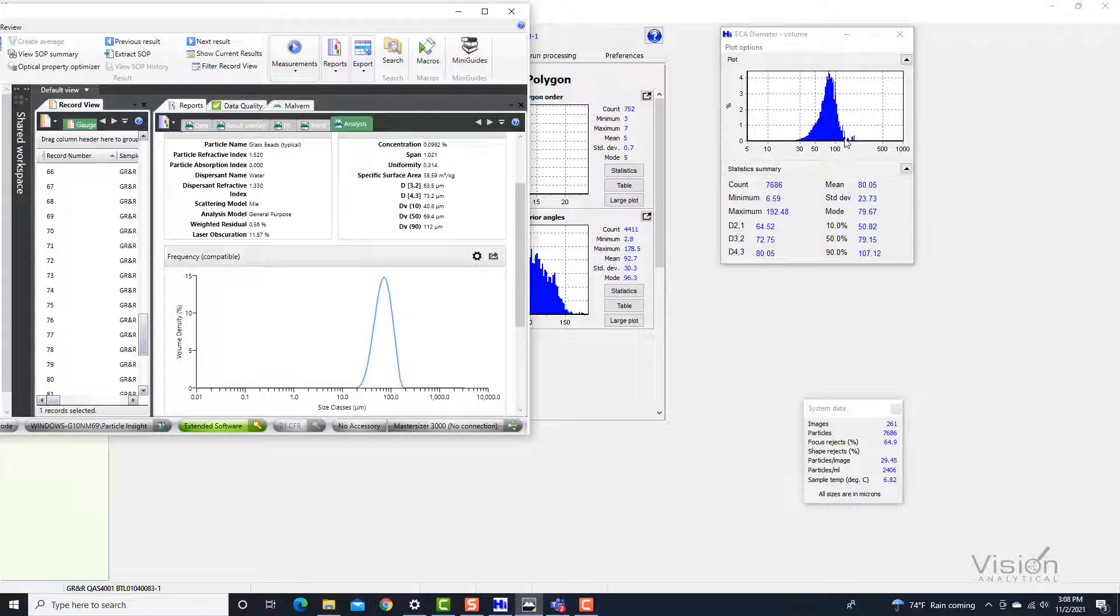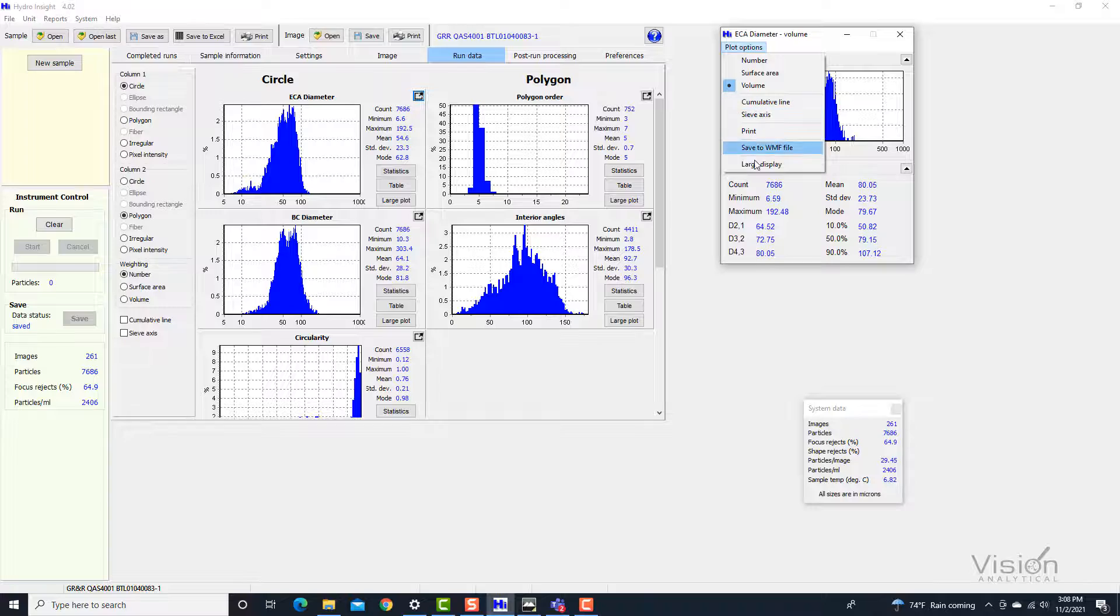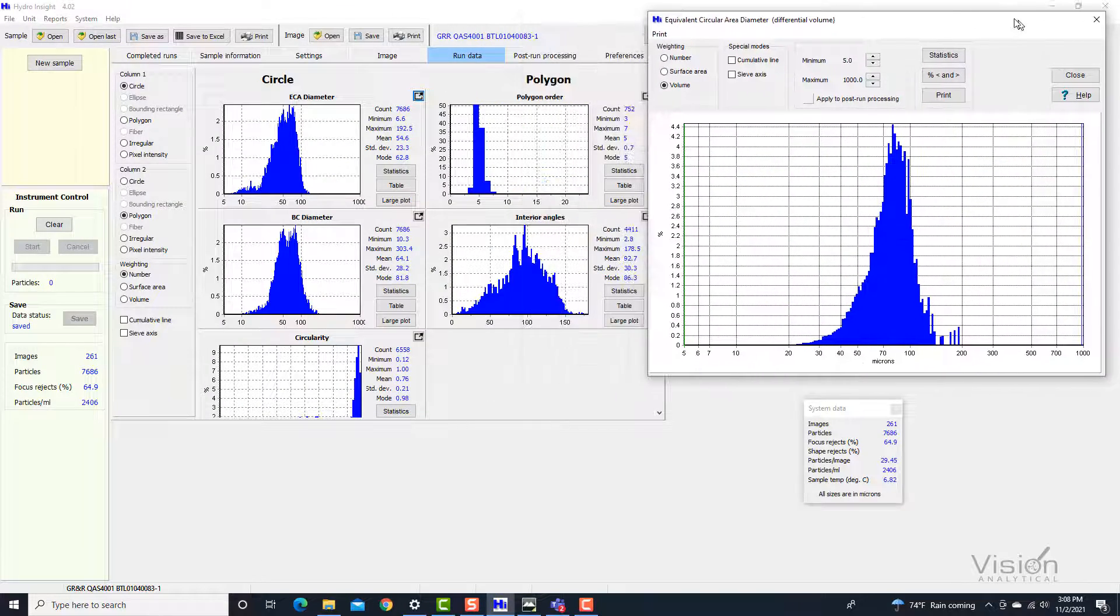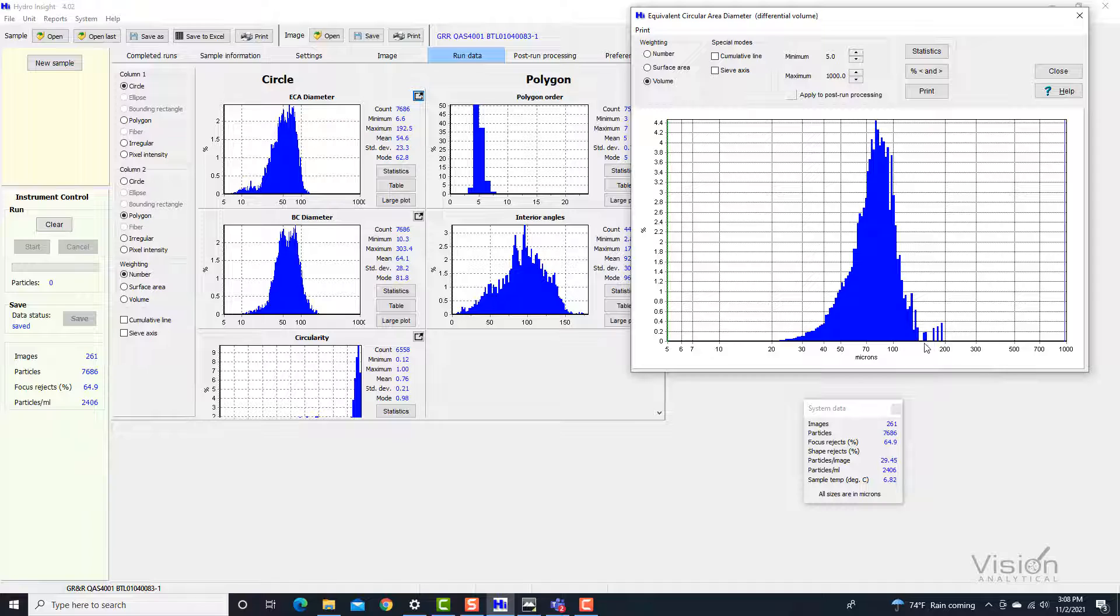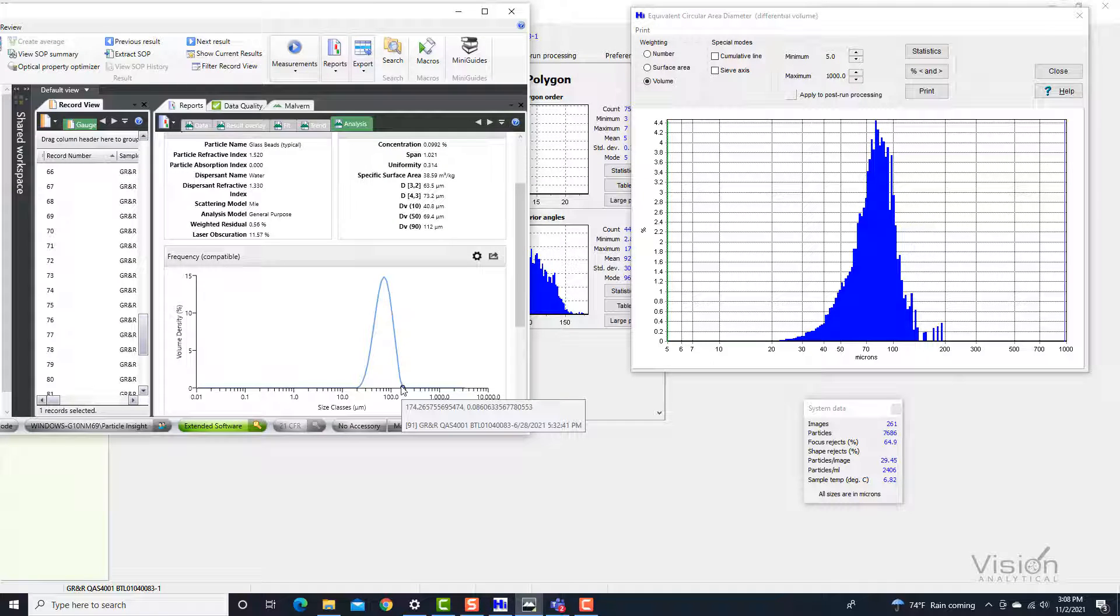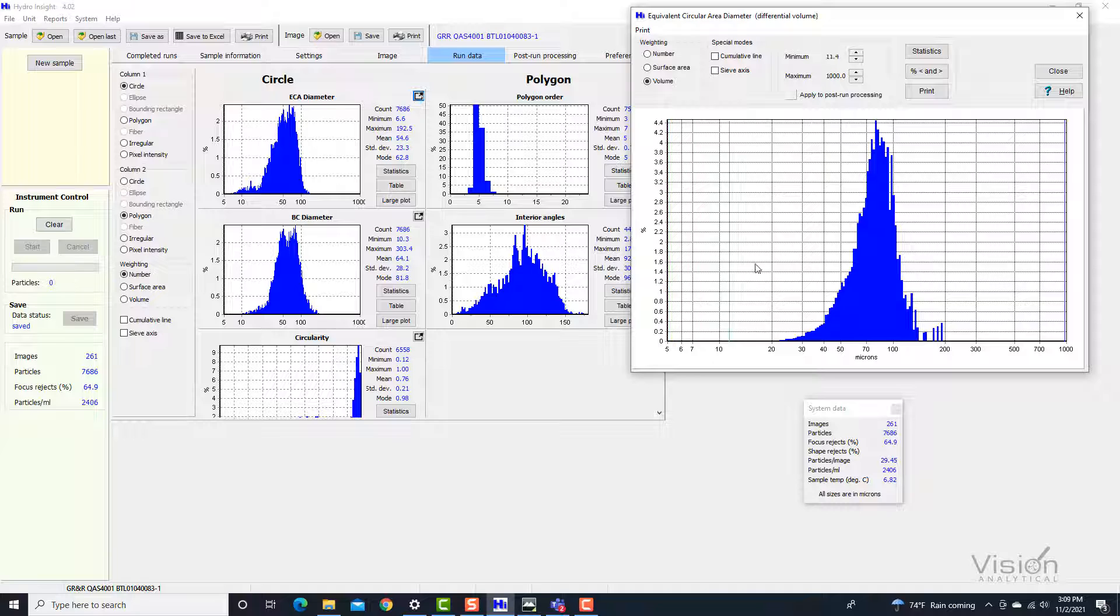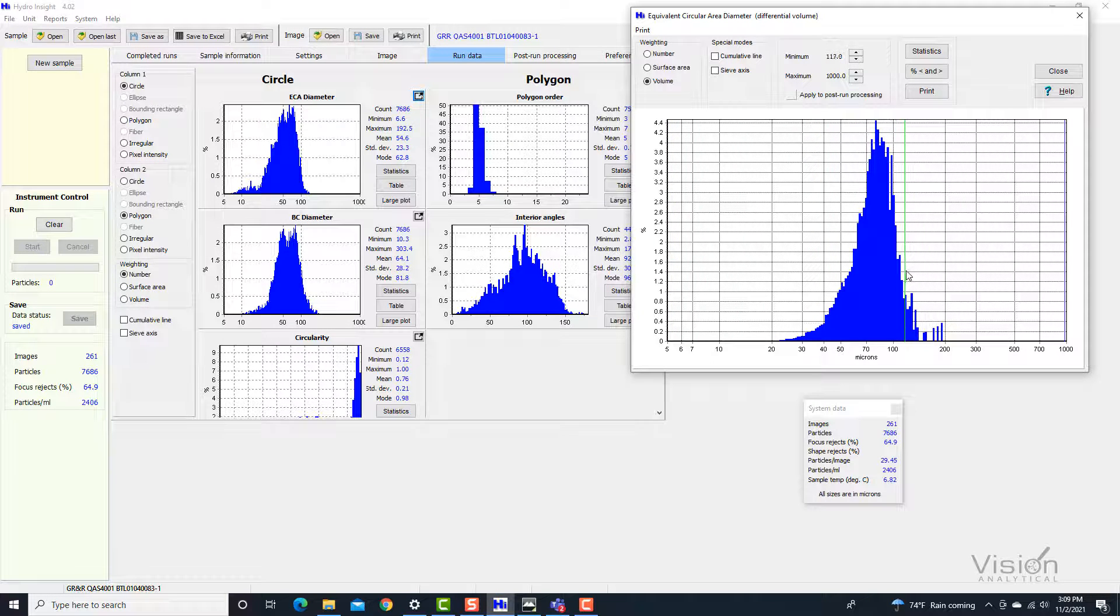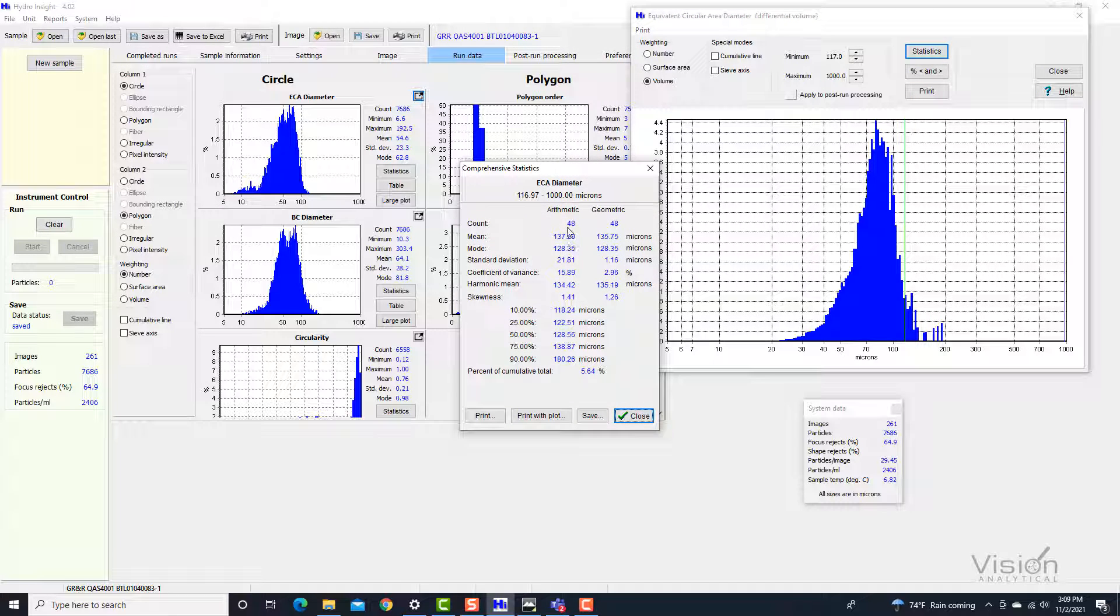Where you see a little bit of information that is a little bit different is the complementary information when you start looking at particles that are greater than about 100 microns. As we can see here in the Masterciser, we went up to about a D90 of about 112. When we look at the Particle Insight, we notice that when you start going anywhere above about 112, there were definitely some particles in there. Very few, but for example, in this case, only 48 particles.